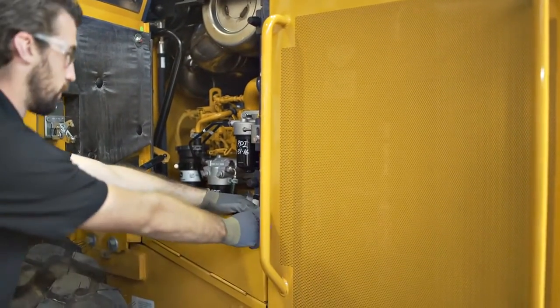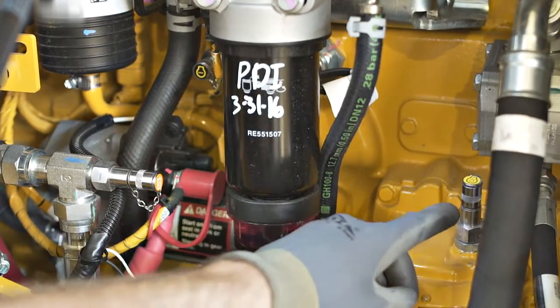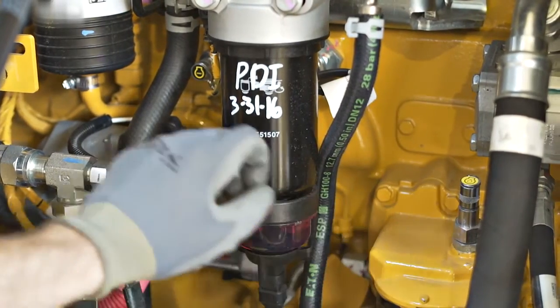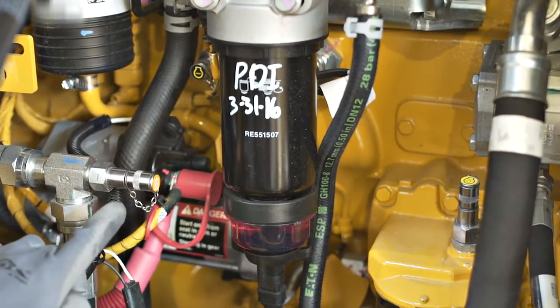Oil samples must be taken on a regular maintenance schedule. Sampling must be performed in a consistent location and manner. Good sampling procedures ensure consistency and reliability of data.